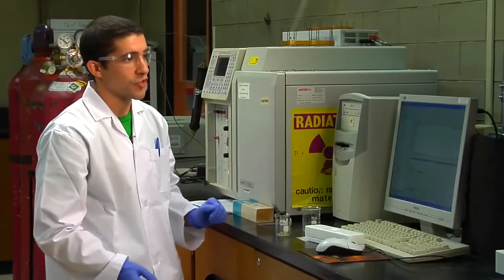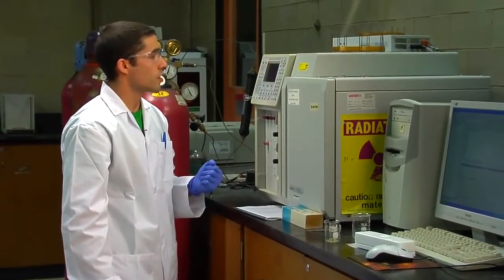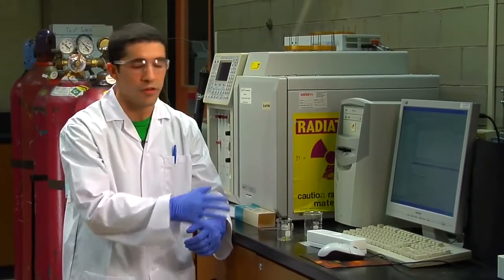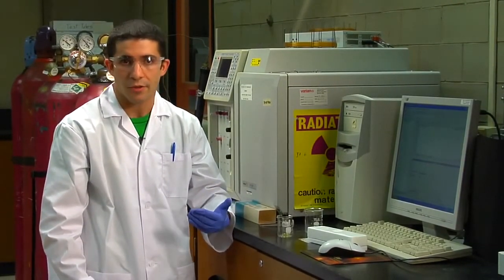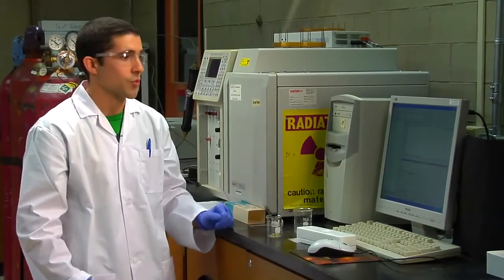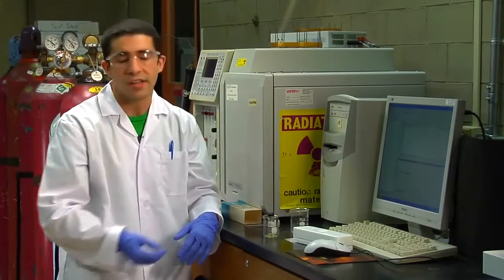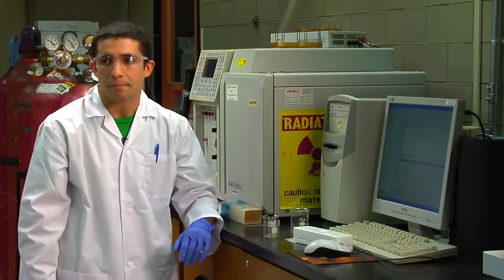Now when the injection is done, which will be in about 24 minutes, the software will automatically save the chromatogram and process it. And then when you're ready to proceed with another injection, you just simply repeat the same steps. You'll have to go back to the acquisition and go to Quick Start and just save another file again.